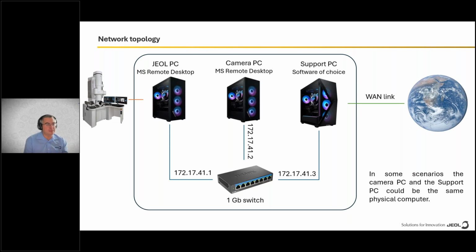It's an embedded system, and our JEOL PC communicates with this embedded system. In the case of a very simple setup like JEM 1400, this is the only computer that you may be using in your facility with this particular microscope.